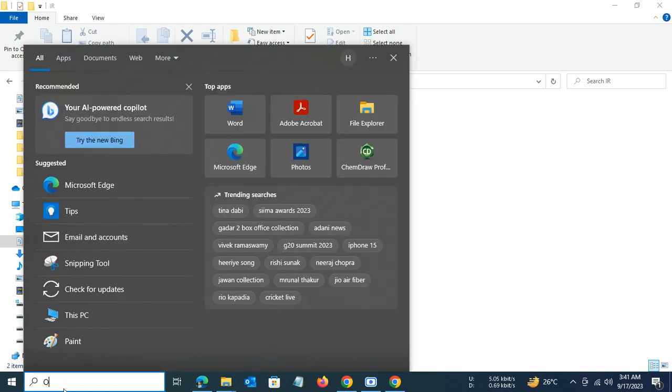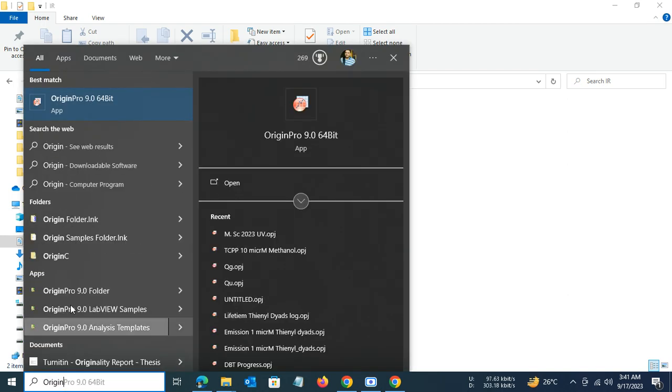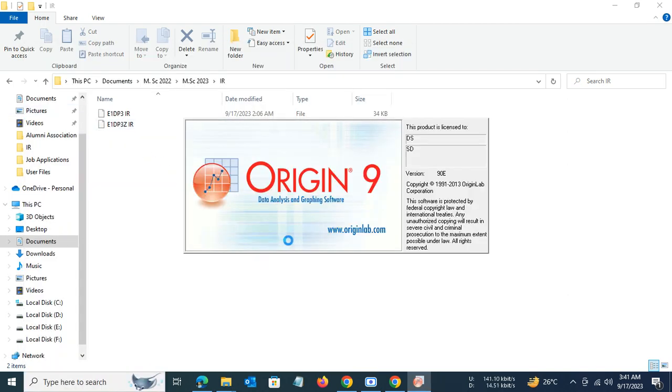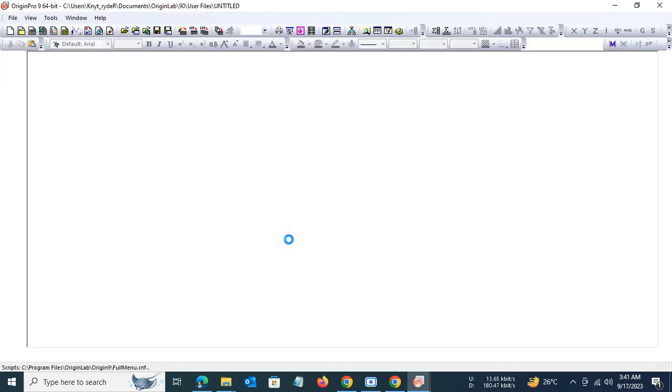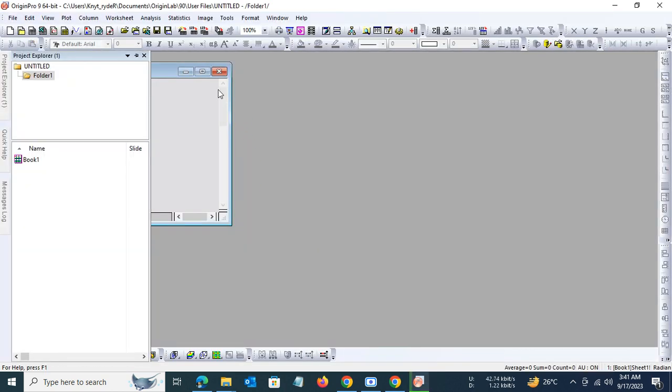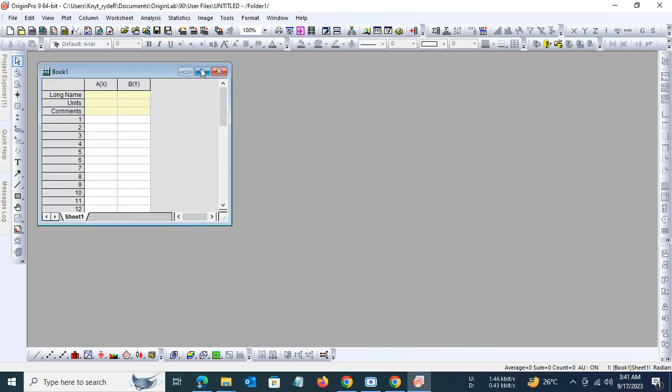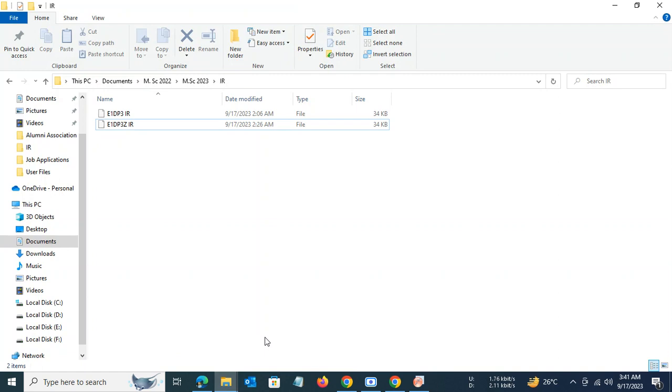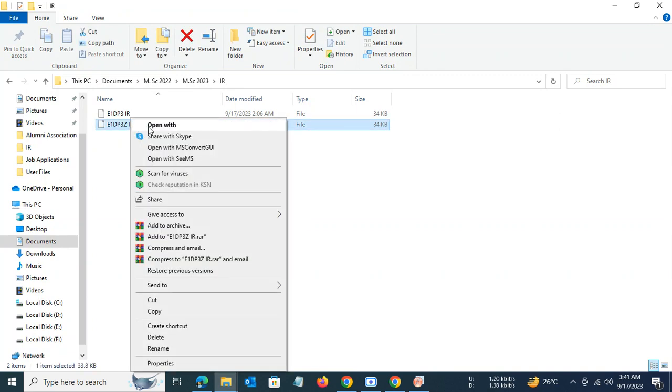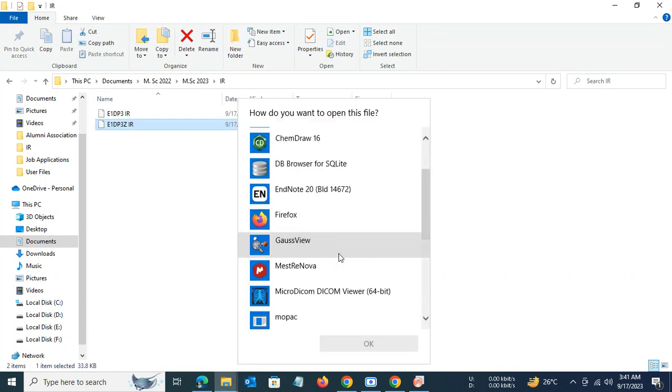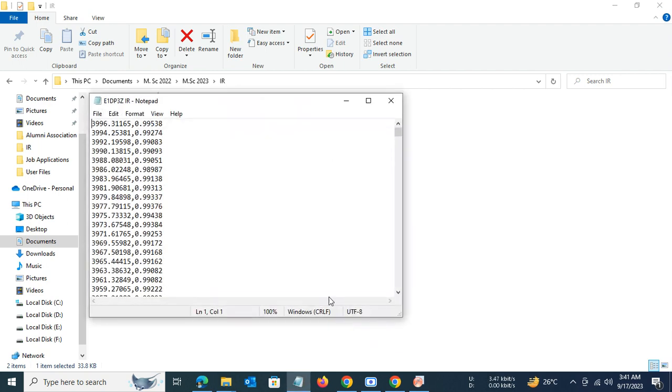We shall use the software Origin, which is popular data analysis and graphing software amongst the science community for plotting the IR spectral graph. In order to plot the graph, let us open the raw data files with the Notepad application to assess the data.